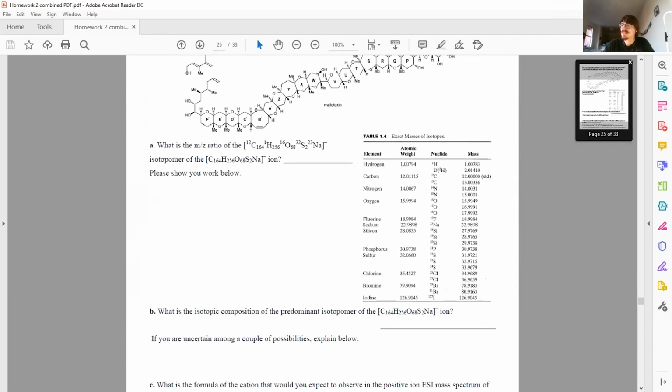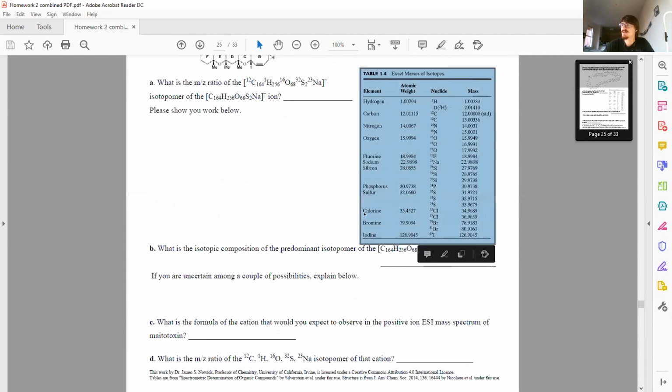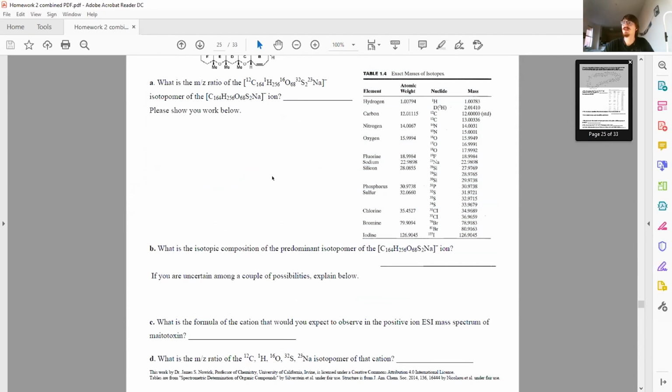And then it specifically tells you the isotopomer that has all of the most abundant forms of each of those isotopes plus 1.00783 from the extra hydrogen. And if you had suggested instead sodium, you would add 22.9. If you had suggested potassium, it's not even on here, but that's 39. Right, James? Yeah. Okay. Yeah, it's 39.